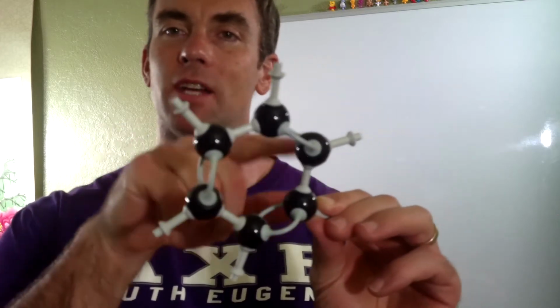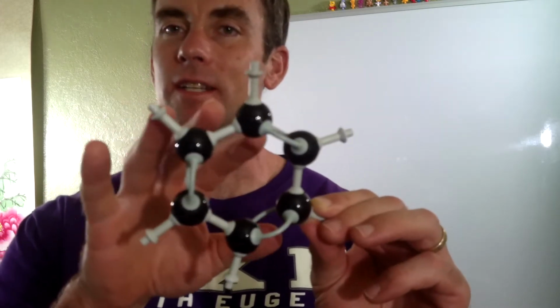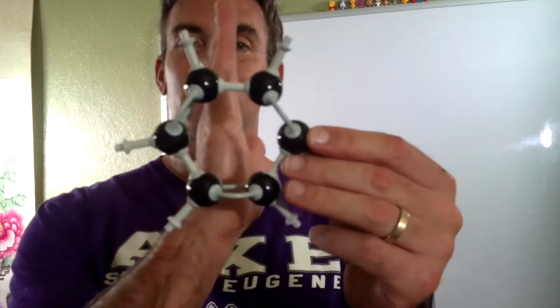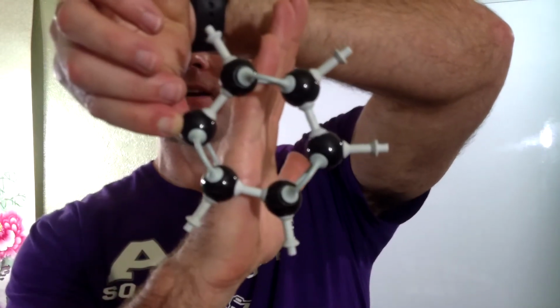I actually think it's really helpful to think about benzene, at least in NMR, as like a big giant donut. And so these double bonds and single bonds are actually equivalent. So in terms of finding symmetry planes, what you'll hopefully notice is that there's a symmetry plane here, there's a symmetry plane here, there's a symmetry plane here, there's a symmetry plane here, and if you look at that, all the carbons are equivalent, and also the hydrogens are equivalent as well, but we don't care about those because we're not talking about that yet.